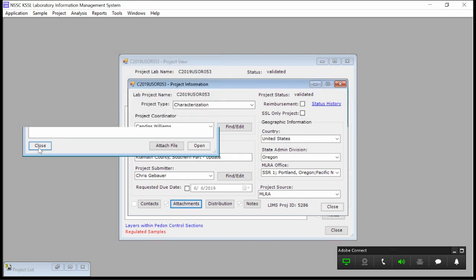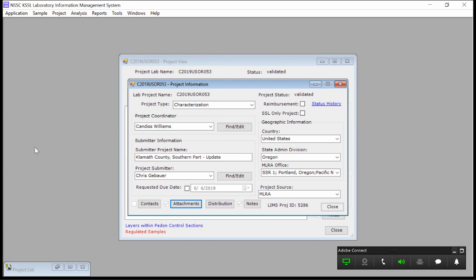When they submit the sample, that's emailed, and they're supposed to include the liaison on that email too. So you should get them at that stage as a liaison. A lot of times they neglect to do that, or they send them just to me. So that's kind of an ongoing thing to remind them to do. But that lets you know that they're submitting a project.